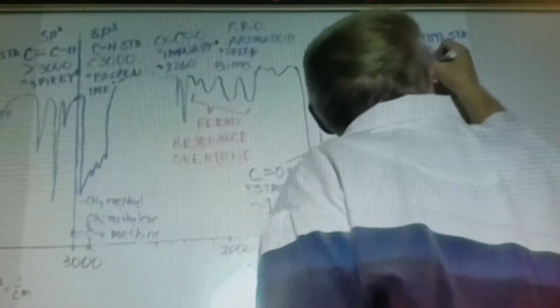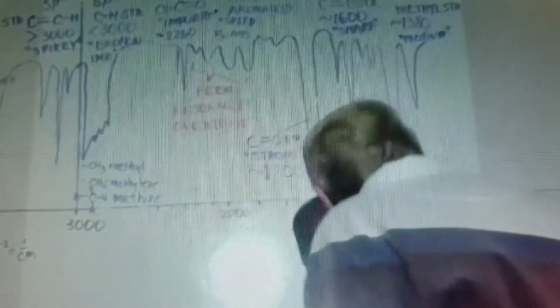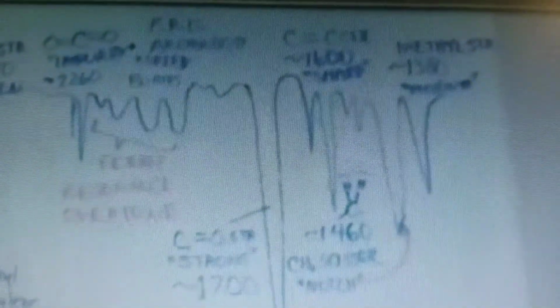It's medium intensity. So sometimes you don't see a real prominent absorption there. It's kind of weak. Now we're getting down to the end, guys. We almost have everything that we want about these absorptions. I'm going to briefly show you how to use them, then I have to move on.